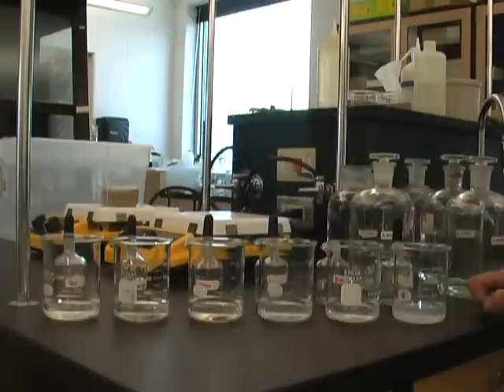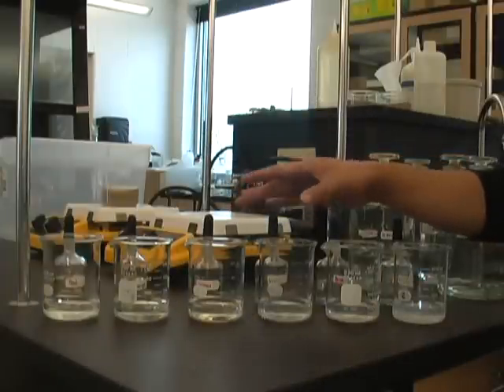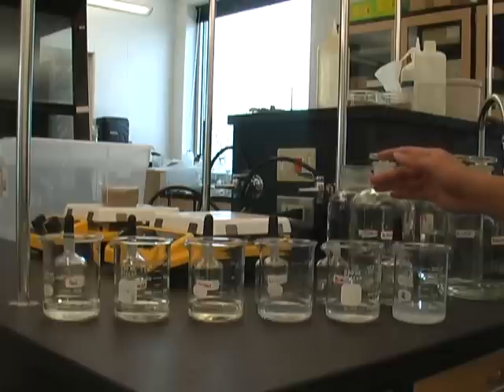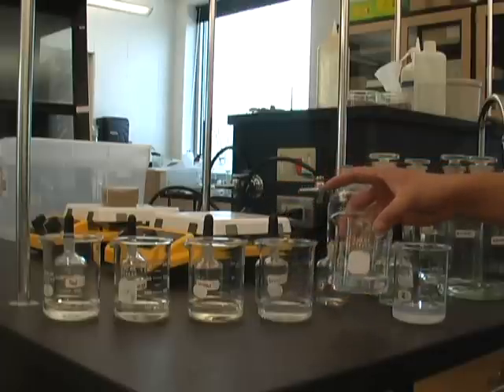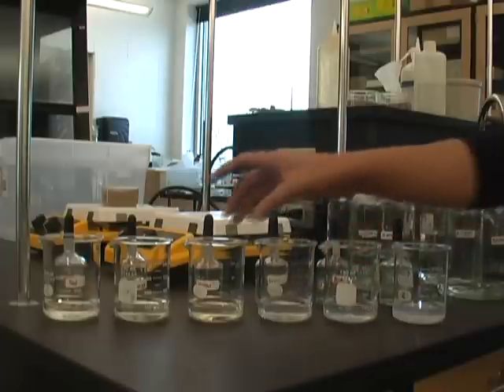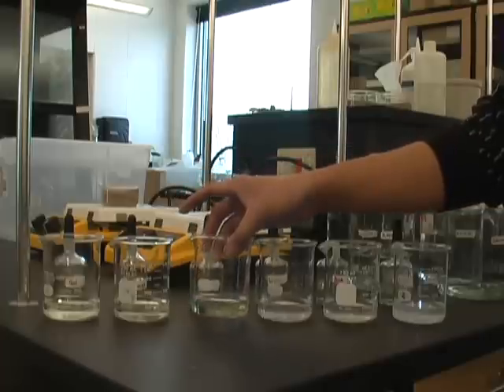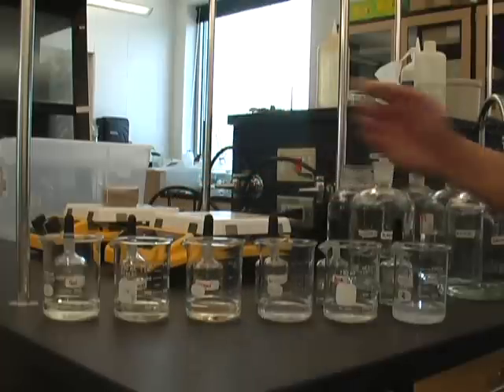This experiment deals with acids and bases. Here I have six beakers that have already all been added base indicators, and the liquid inside them is hydrochloric acid, which is an acid. That's why it still stays clear, because there's no base which the base indicators would indicate.